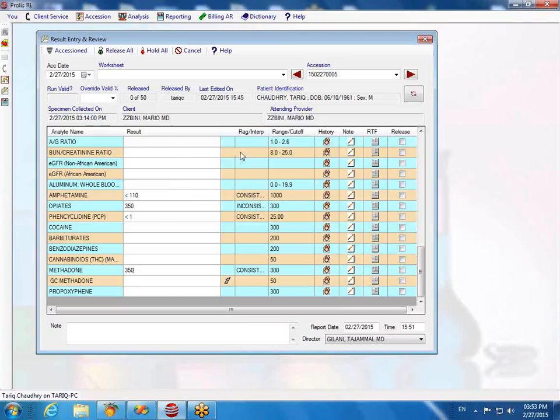Right. All right. Let's delete that number. Tariq, let's delete that number. Which number? This number? Okay, I think let's go to this. These features are all, I think, very good, Tariq. I really admire this. But let's go to the interface thing. I think that's where Oz is interested. Okay, that's fine. We can discuss these things.